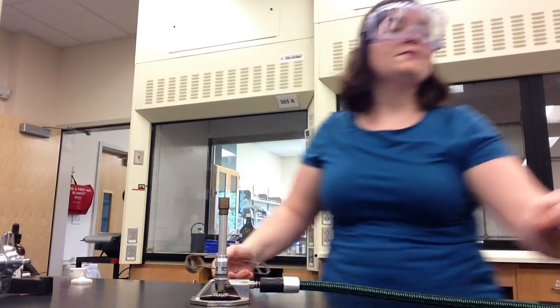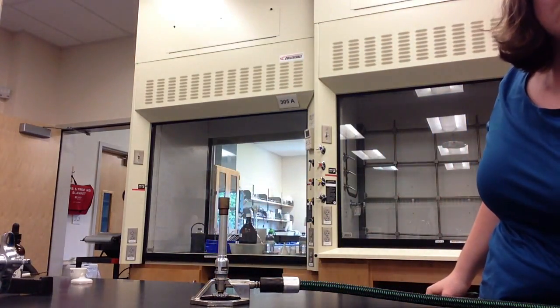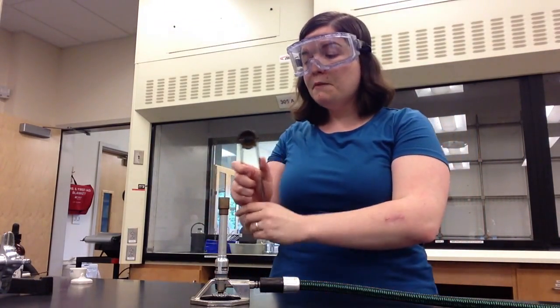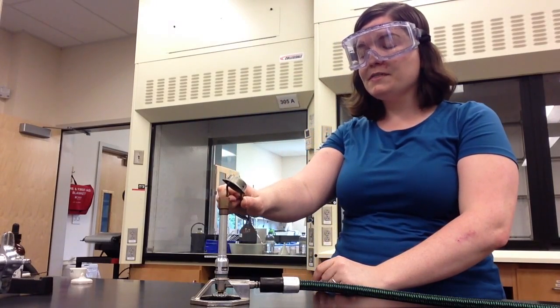To begin lighting your Bunsen burner, first turn the handle from perpendicular to parallel. You'll then hear gas coming out of the Bunsen burner, and when you're ready, you can put the striker next to the Bunsen burner and pull on it.